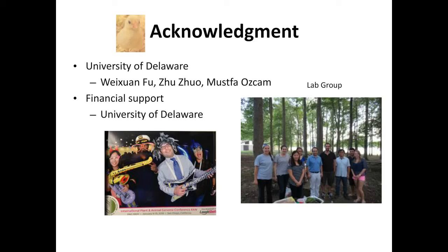If we want to create a gene model, it needs to be multiple tissues. If I'm working in one tissue, I would be confident that the gene model also covers where my gene ends. But yes, that's possible. This technology needs to be applied across many more tissues to be able to provide the models that will work with every tissue.